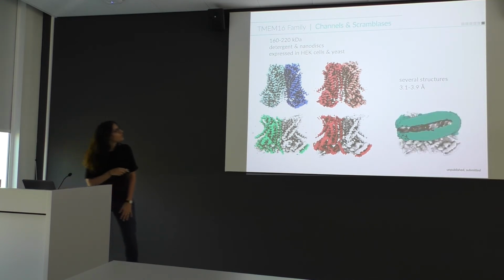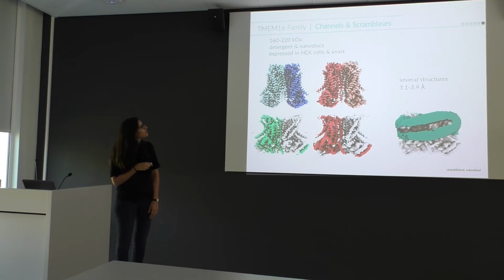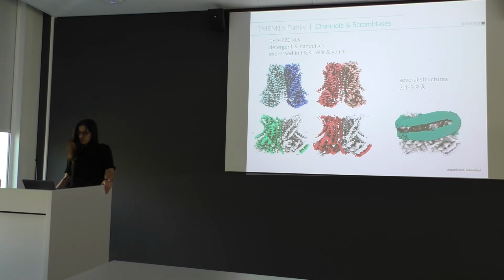One thing I also like about this family is that we can resolve the nanodiscs. This is one of my favorite take-home messages of this story, where we also see a bending of the membrane, and we believe that this is functionally important for the protein.